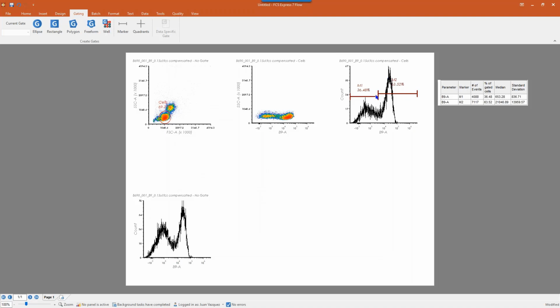All right, so we have our positive, we have our negative. From this, we're going to need our median. We're also going to need a standard deviation, right? Specifically for the negative peak. What we're also going to do is we're going to create a separation index. So what that means is we're going to need an 84th percentile from our negative peak.